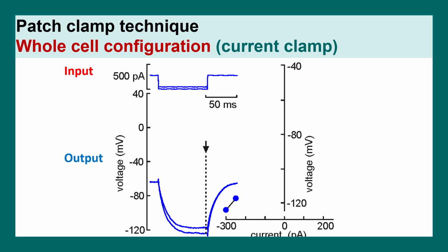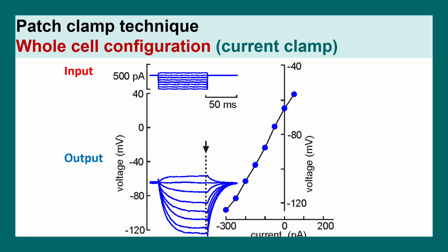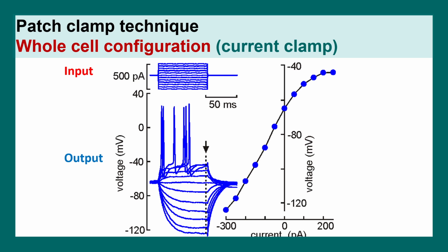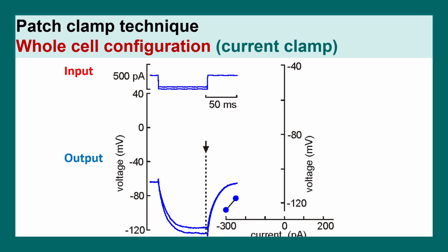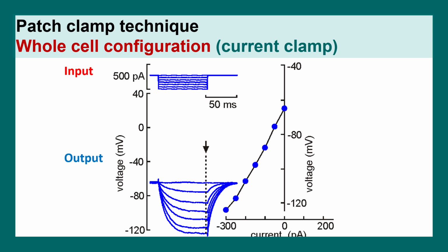So you see how the voltage is changing when we keep the current at a particular level. And that can be understood from this particular voltage versus current curve, and how the curve is changing.